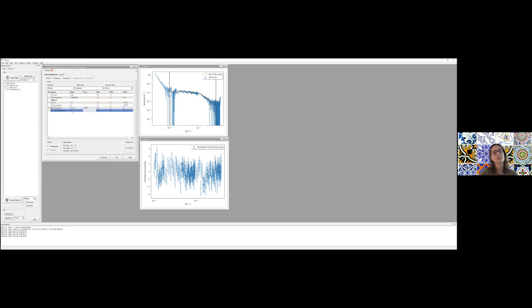And it does change. So it's now more like a ratio of 2, which is more consistent with what we know. And also the fit to the data is better, and the chi-square is also better. But I manually changed this one, but kept it fixed. I only fitted the second one.